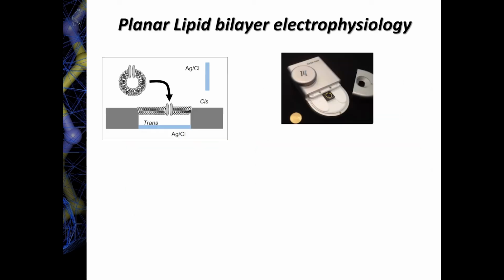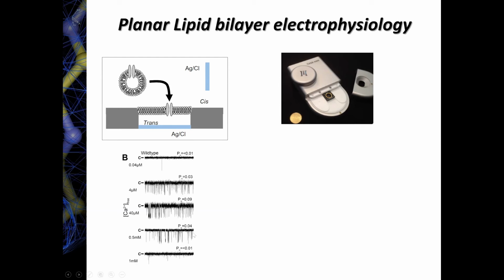mutant. Okay, so as Conrad nicely introduced, we also did some bilayer electrophysiology to characterize this mutant and verify what it really is doing, particularly under the conditions that we also want to investigate via cryo-EM. And so on the left here, you see single channel traces of wild type big ryanodine receptor. And we're looking at recordings performed at different calcium levels. And you see at very low calcium levels, there are very few openings. These openings increase with increased calcium concentrations and then decrease again as you go up to the millimolar range.